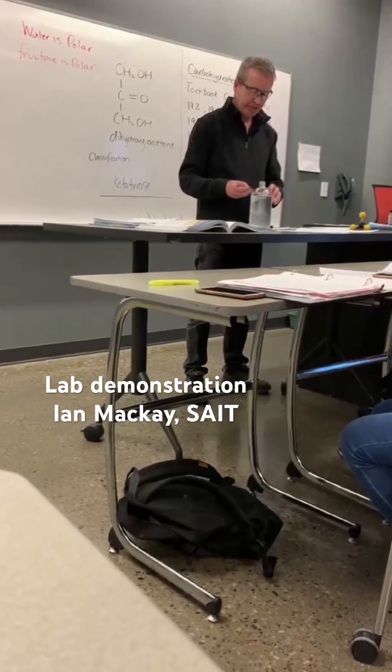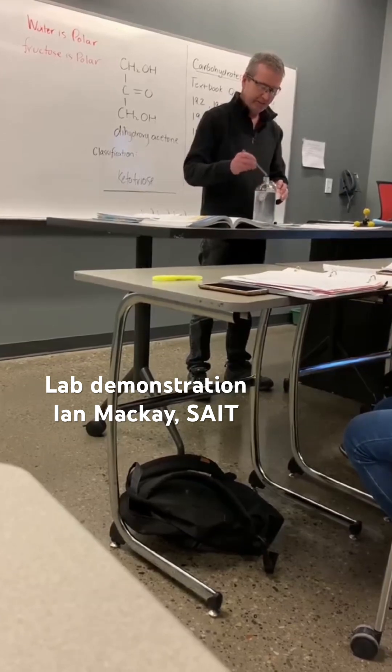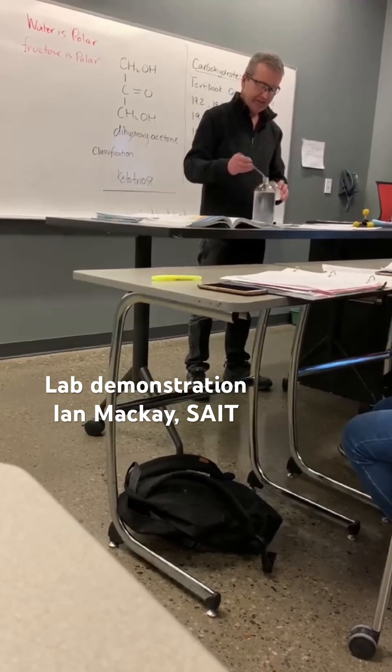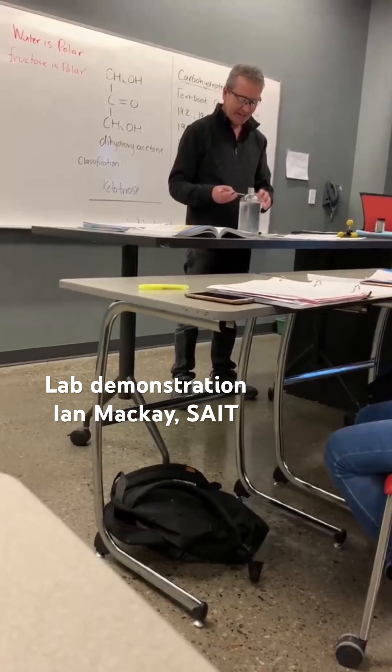One, two, three — quantity of transfer — four, five. Oh, you just failed your weighing confidence.